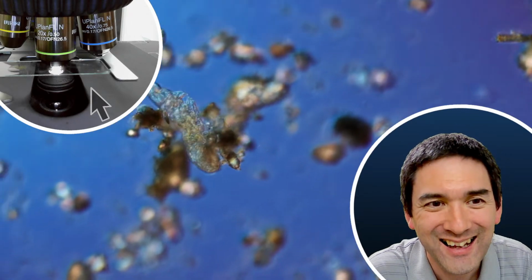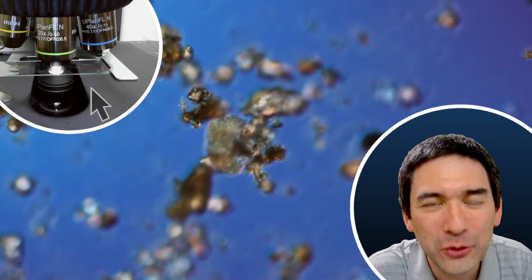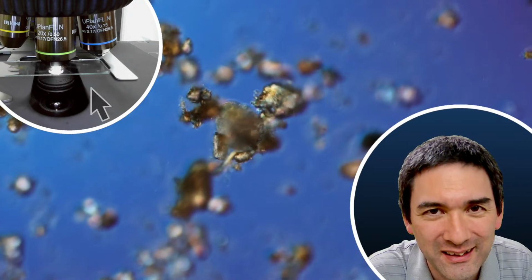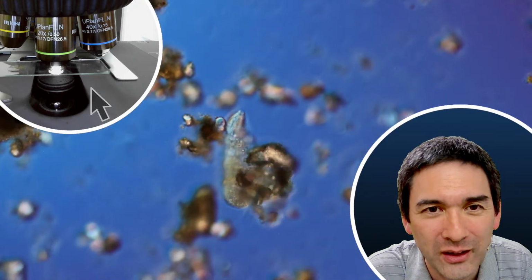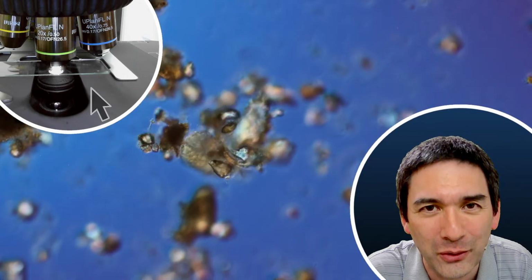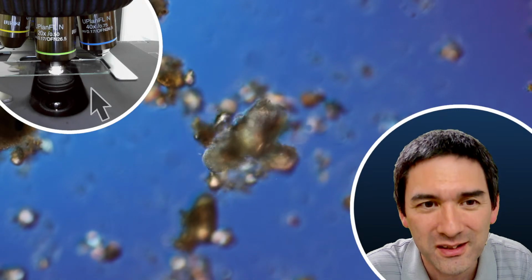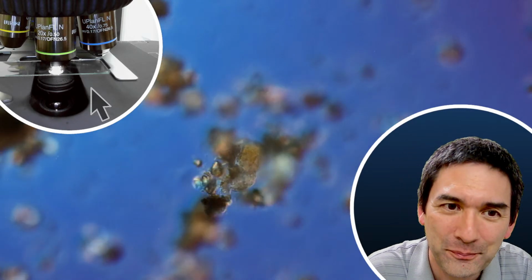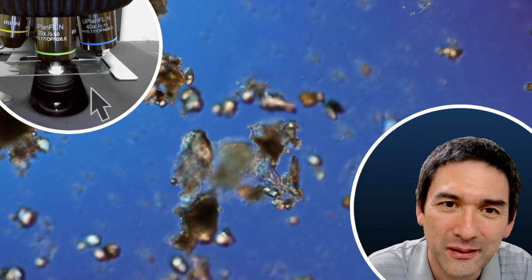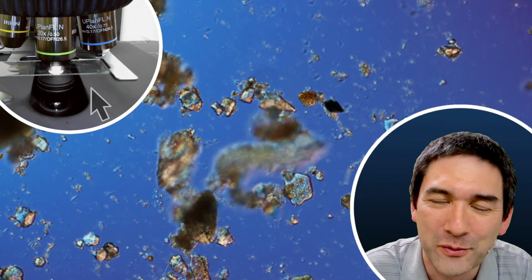Because look, you will only notice that dust is present if you actually move the slide like I'm moving right now. And if there is somewhere a dark spot that doesn't move, then you actually notice that there is dust there. But if you do not move the slide, then the dust kind of blends in a little bit with the other things on the microscope slide.